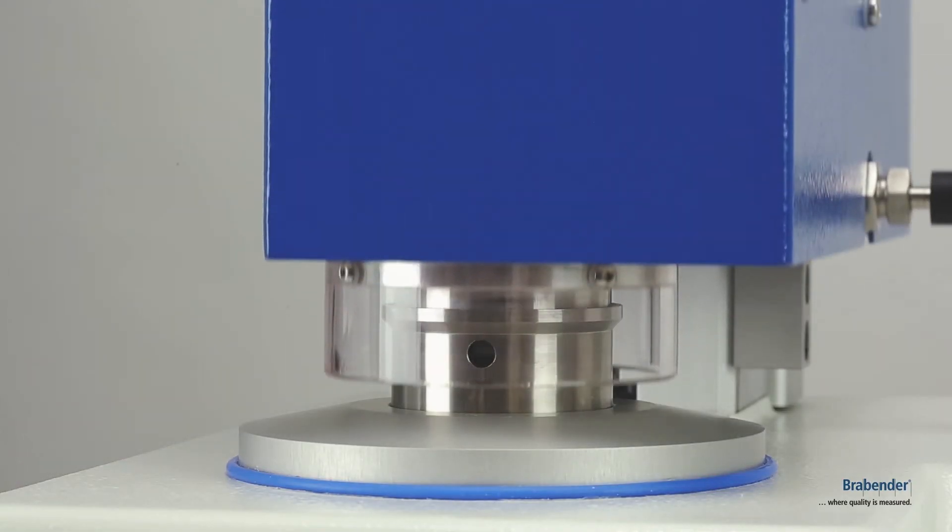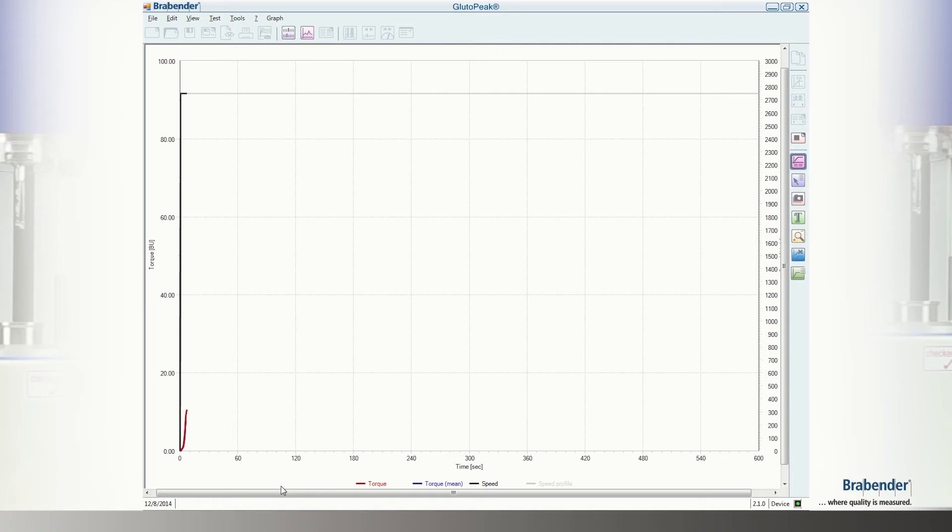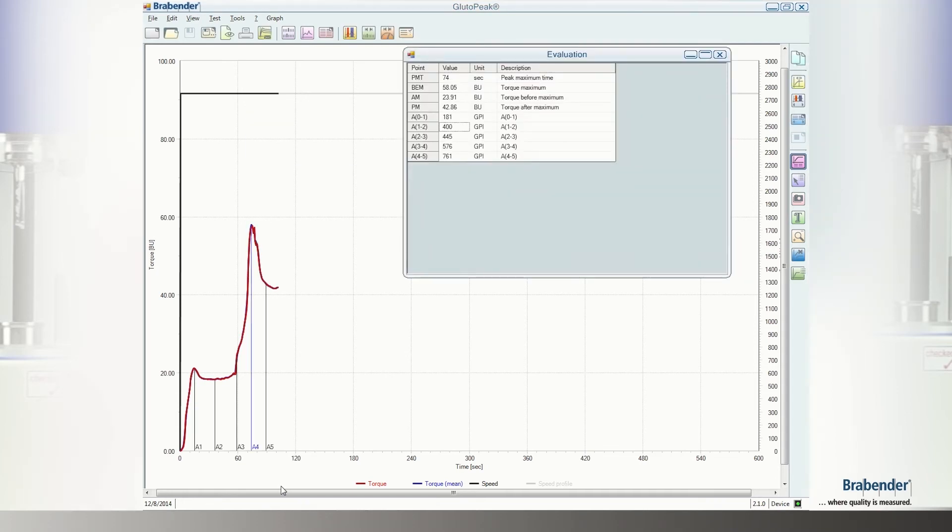Funnel 3 to 10 grams of the sample material and lower the measuring head. The application starts automatically and records the graph in a few minutes. On average, 10 tests per hour can be carried out. Thus, the Gluto Peak evaluates quality by using cutting-edge technology.